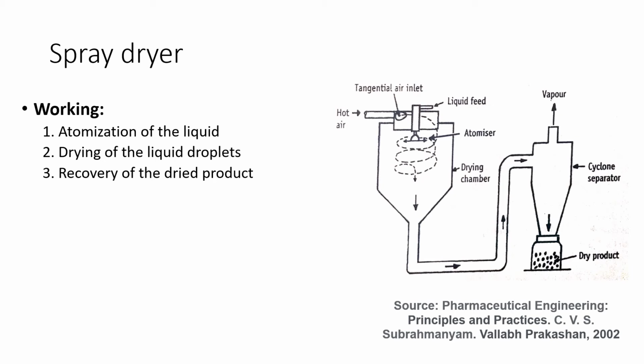Here we take the help of centrifugal force of the atomizer, which drives the droplet to follow the helical path. Because the path is helical, it will be longer rather than directly coming down by its own weight due to gravity.